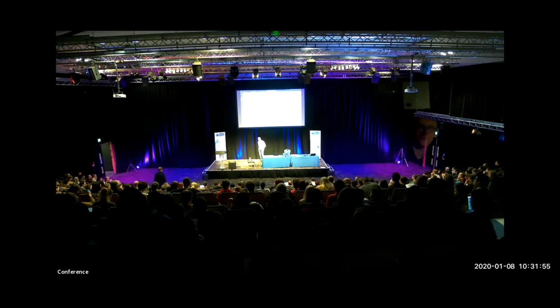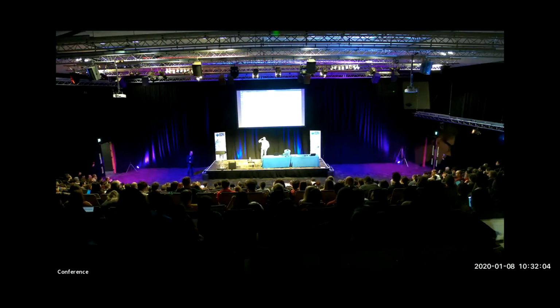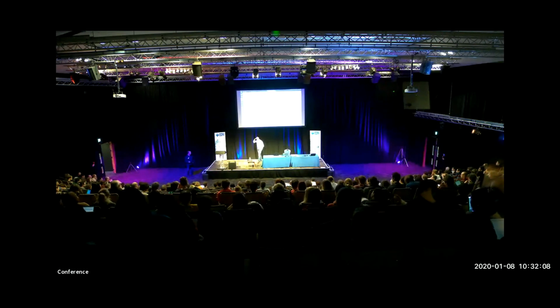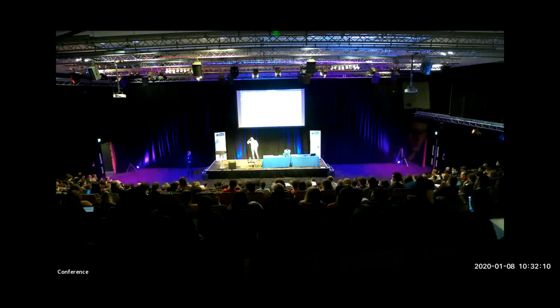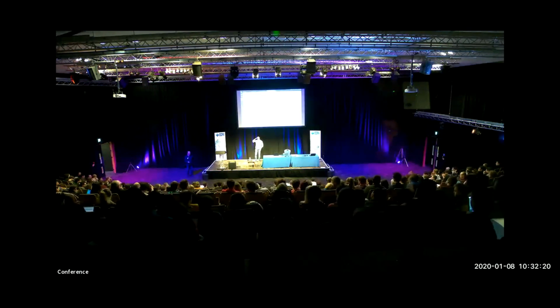If you use our cloud, it does now use SSL security for the access, but we're conscious of the fact that many commercial users won't want to upload their important ligands and data to the cloud. So you can either run it on a local cloud or use it locally on your own laptop. So that functionality is there.